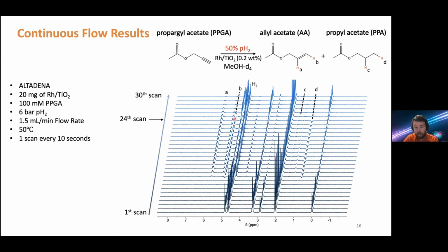And as you can see, this hyperpolarized signal slowly decreases. You might be tempted to think that that's some sort of relaxation process, as I first did. However, it's not that. It's because the pressure of the system is higher than the back pressure regulator. We typically work at 150 to 200 psi. The back pressure regulator is set to 40 psi. That difference in pressure is sort of like a leak, if you like. So the syringe pump is turned off, the pressure has to go somewhere, so it leaks out of the back pressure regulator, which has the effect of slowing down the flow rate, which leads to less signal because you're flowing slower.